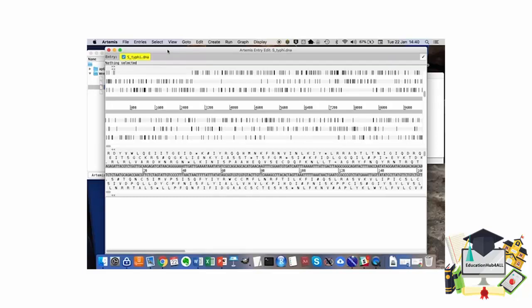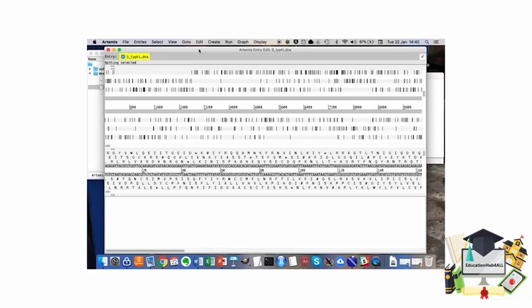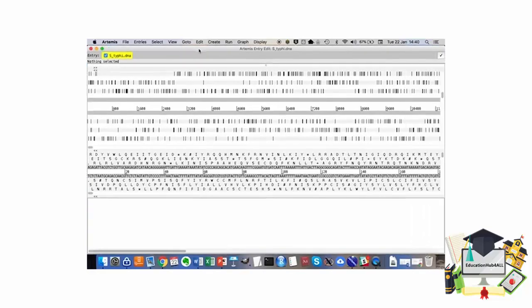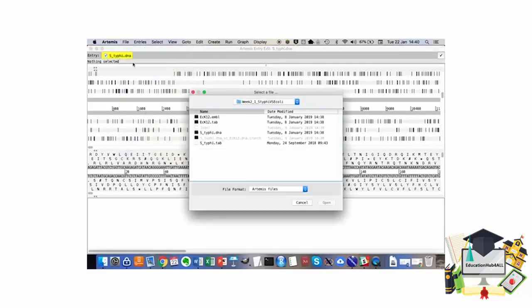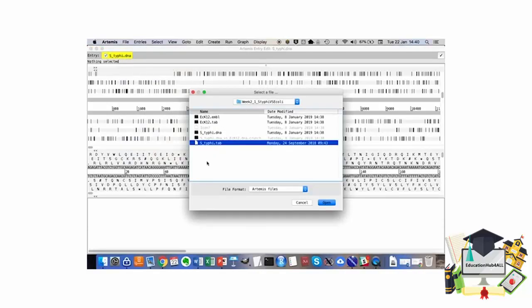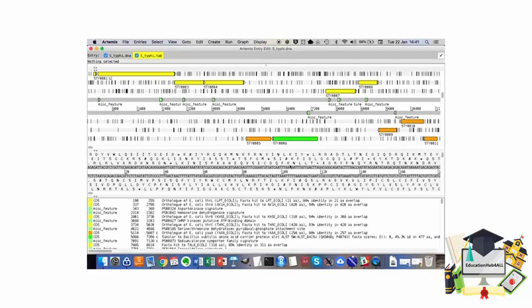Notice that it looks naked—there are no annotations in this Artemis window, and that is because the annotation for this particular genome is in a different file. In order to load the annotation, I'll go to File, Read an Entry, and I can select the annotation, which in this case is S_typhi.tab. Remember that the annotation can come in different formats; the extension can vary. It's reading from this file and asking whether I want to see the warnings. I'm going to say no, and here is the annotation.